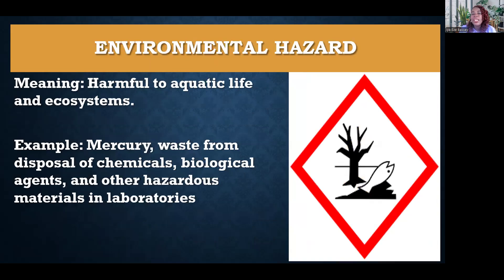The next one is environmental hazard. A lot of waste you produce in the lab would harm the environment if released carelessly. If you see this sign, it means that the substances there are harmful to aquatic life and ecosystems, and you should know how to dispose of them — follow the SOPs. Examples include mercury, waste from disposal of chemicals, biological agents, and other hazardous materials in the laboratory.